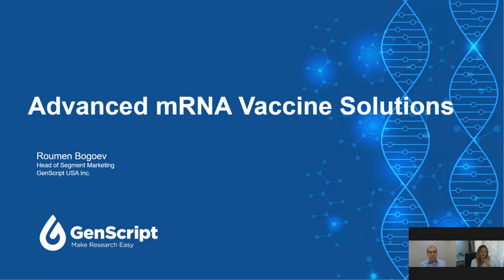Very good. And Rumen, we're going to go ahead and wrap with this final question here. Can you guarantee the A-tailing lengths of the mRNA? So we have multiple technologies for producing the A-tailing, and we can definitely guarantee the length, and we can definitely meet your requirements, whatever they are, 100 A's or less or more. And we have very high consistency and homogeneity of our A-tailing. So that's what I showed on one of my slides.